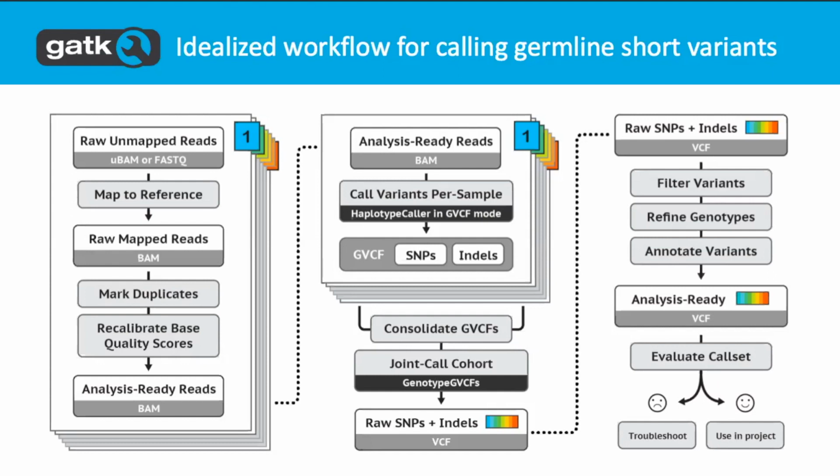Multiple additional samples available in the laboratory. We have the single sample and leave it up with the others, or you apply the CNN algorithm. I don't think I followed you. Can you repeat that one time? If you have kind of identical samples available in the laboratory, would it still be better to pull everything together, or to run the CNN algorithm by individual samples?